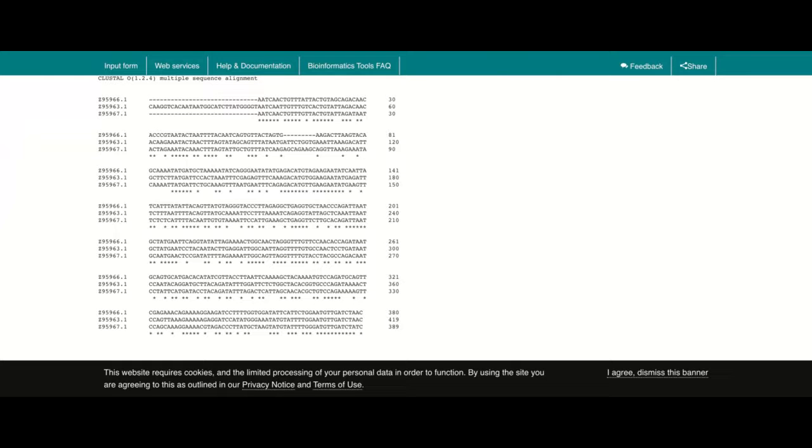So the way I find that is I do a command find if I'm on a Mac, or control F if you're on a PC, and just keep typing stars and seeing where you find the string of, I said 11. I think the way I did that was, let's see the maximum number of stars in a row. 1, 2, 3, 4, 5, 6, 7, 8, 9, 10, 11. And then if I was like, are there 12? And then I did 12, it says no 12. So here my 11, that's the biggest stretch where they agree exactly.